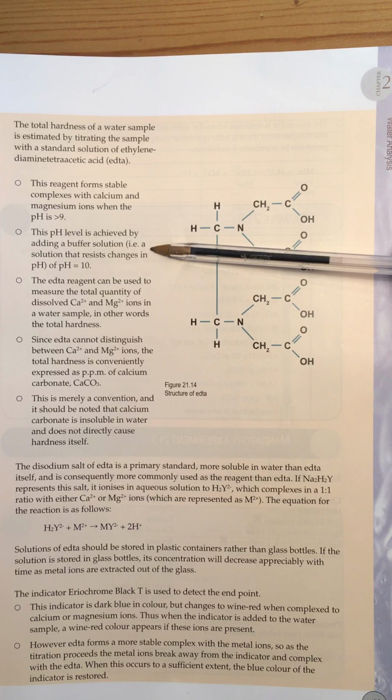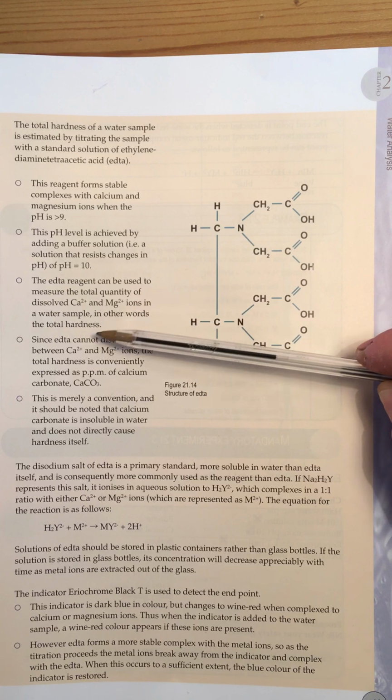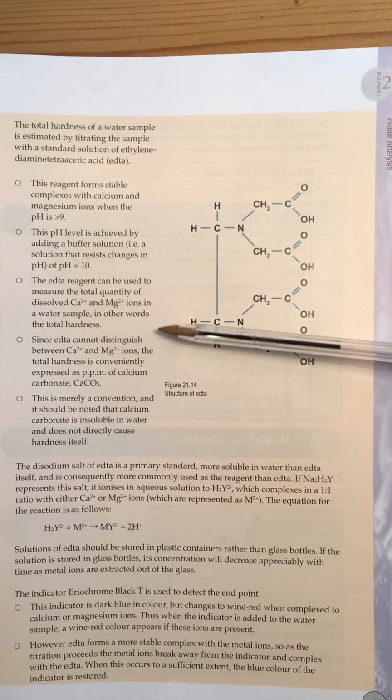The EDTA reagent can be used to measure the total quantity of dissolved calcium and magnesium ions in the water sample. In other words, total hardness. Since EDTA cannot distinguish between calcium and magnesium ions, the total hardness is conveniently expressed as parts per million of calcium carbonate, CaCO3.